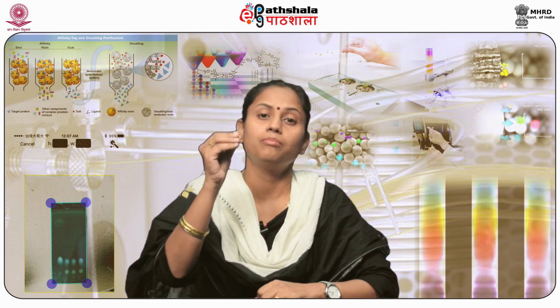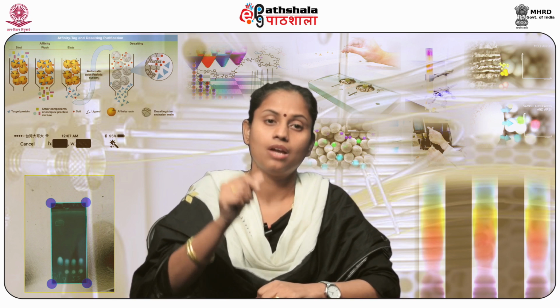Mobile phase can be a liquid or a gas depending on the type of chromatography that we select, and it passes through the stationary phase. It contains the mixture of compounds which are to be purified or separated. Now, what is an analyte? An analyte is a substance that is to be purified or separated from the mixture.